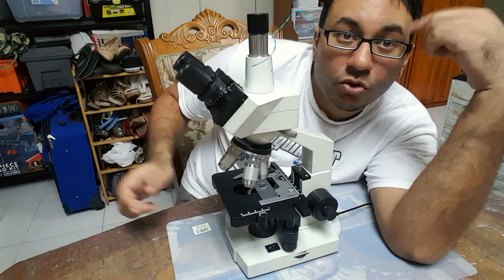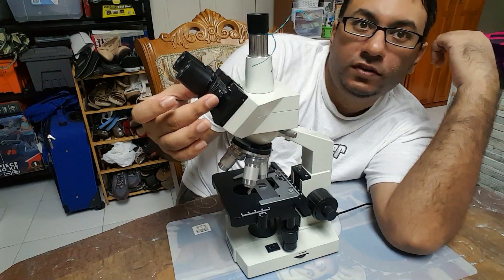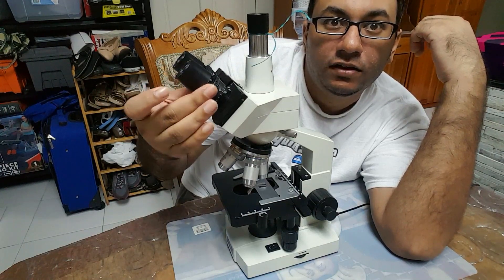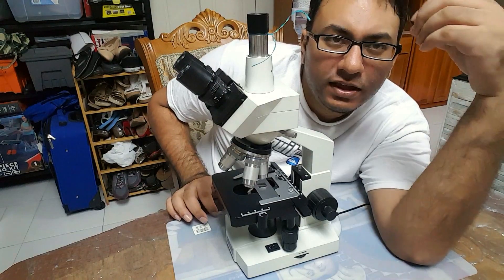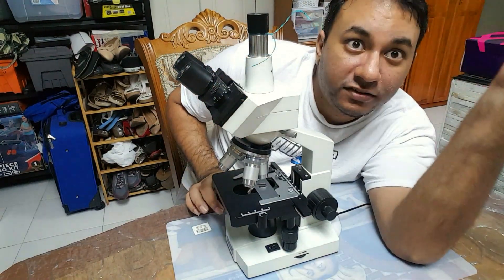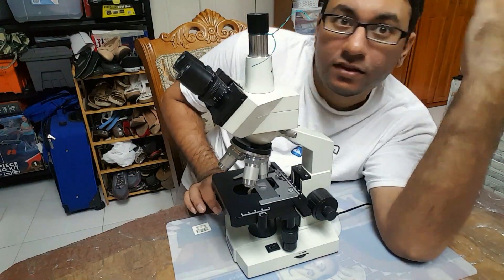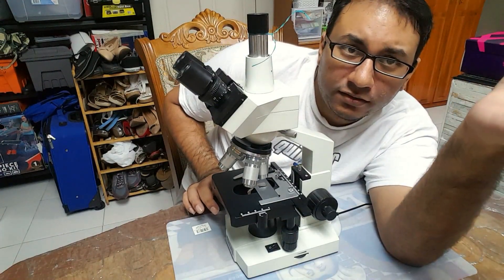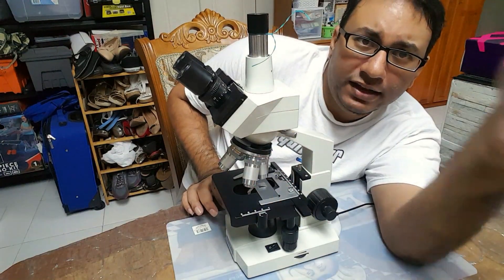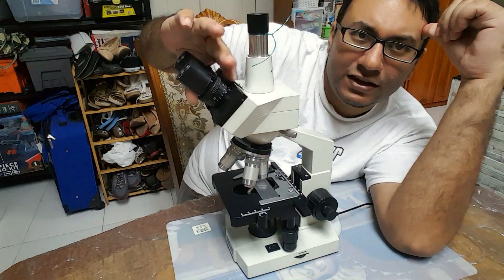The good thing is I was able to use this with or without glasses. It has some corrective support — you turn these values on the side here and it changes the focus, acting like glasses for you. If you have vision issues you can take off your glasses. I prefer keeping mine on, but many scientists who use their eyes a lot for reading will find this is not going to be a problem.